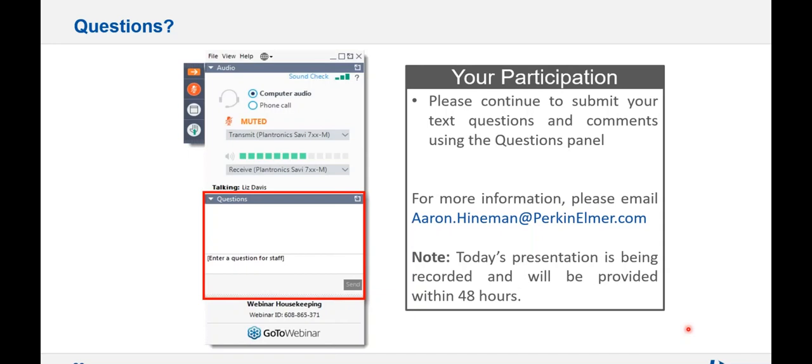The next question, are there videos to watch on this procedure? I'm assuming it means like the contact replacement procedures and so forth. So we do have a ZL video that was made several years ago. I think it used the original contact cylinder tools. So I don't think we have a video that has the new tools.